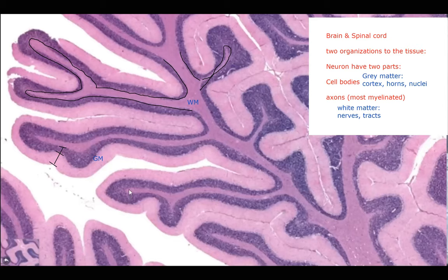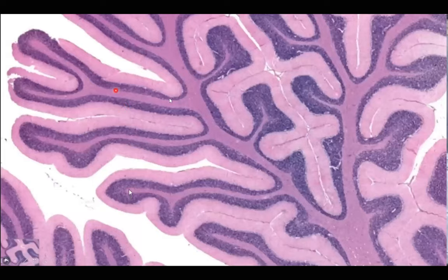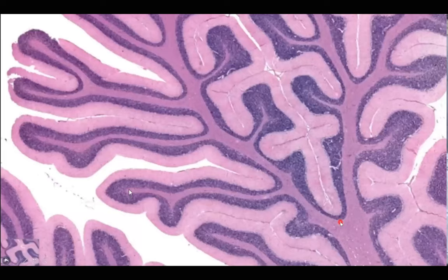On the second picture, we again see the white matter deep and the two layers of gray matter. We have a folium, a sulcus, our white matter, and our gray matter. Notice the white matter of the cerebellum has an elaborate branching, tree-like appearance — this is known as the arbor vitae, meaning 'tree of life.' The white matter forms the arbor vitae.